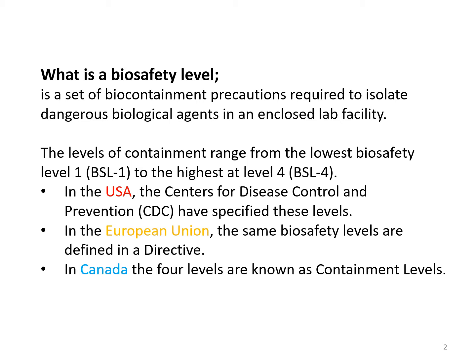First, what is a biosafety level? A biosafety level is a set of biocontainment precautions used to isolate dangerous biological agents in an enclosed lab facility. So you can say these are different labs according to the nature or hazards of the biopathogens. There are four levels, from biosafety level 1 to BSL 4.